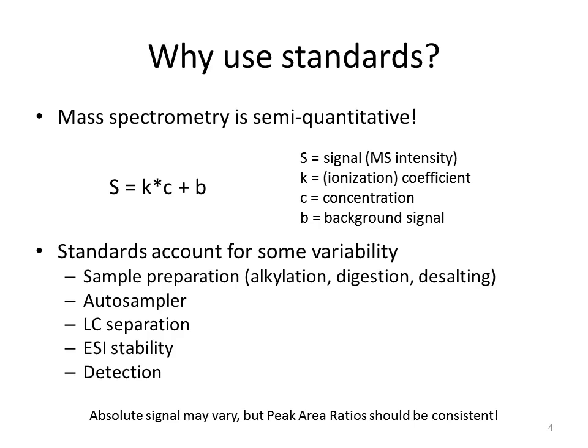So again, going back to the comparison against Beer's law, we would always expect that if we see an increase in our MS signal, that correlates with an increase in our concentration of our analyte, because they're on opposite sides of the equation. But the background signal contributes to our overall signal, and then there's this coefficient that we cannot calculate ahead of time or theoretically predict at this point. And because these are all unknown, the best way to start is to have a standard.